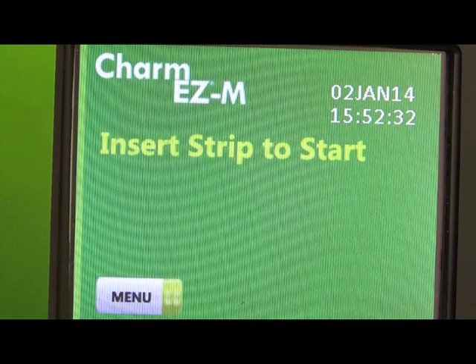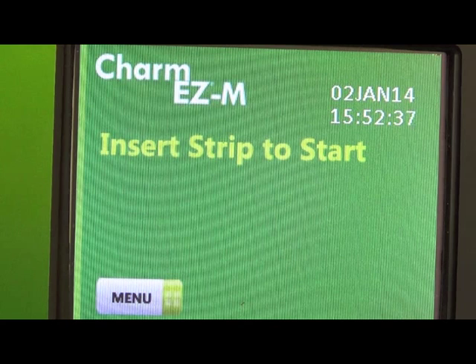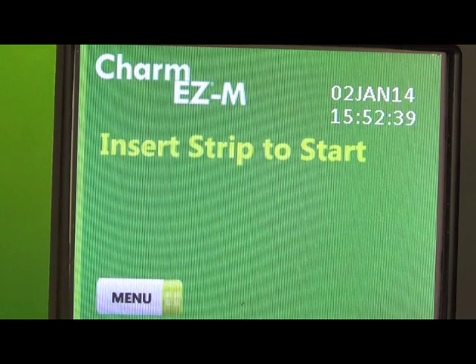This video will review how to set up a different Rosa mycotoxin channel on the EZM reader and how to assign associated commodities for that test.